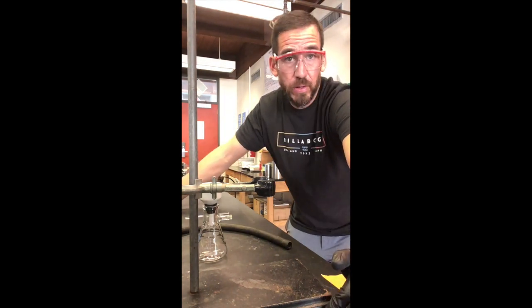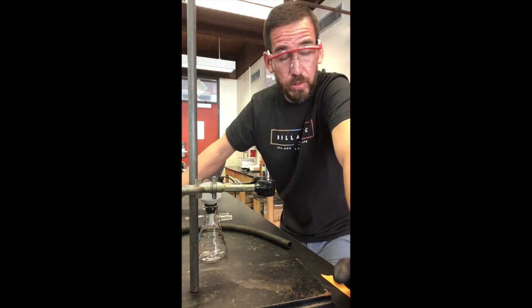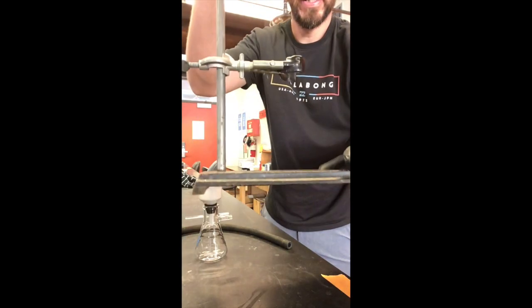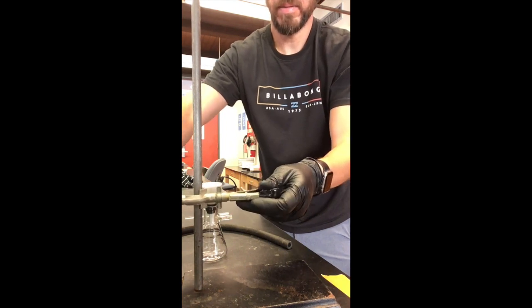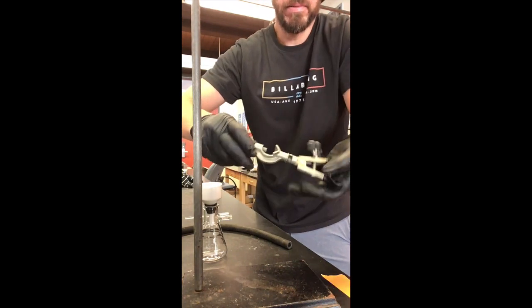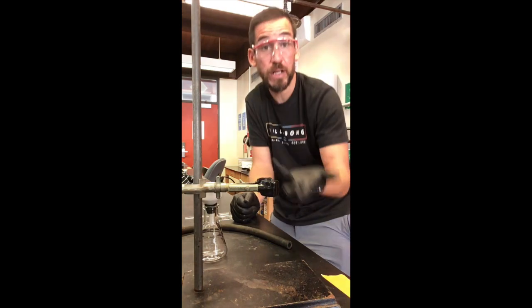Now what we want to do is go ahead and filter off that solid material and then isolate the nice, pure, crystalline caffeine. And so the setup that we want to use for that is a vacuum filtration. So what I have here is a lab stand, and then we have this clamp. So this is one of the types of clamps that we have in the lab, and we basically screw it on to this pole, and it holds everything in securely so that it doesn't fall.